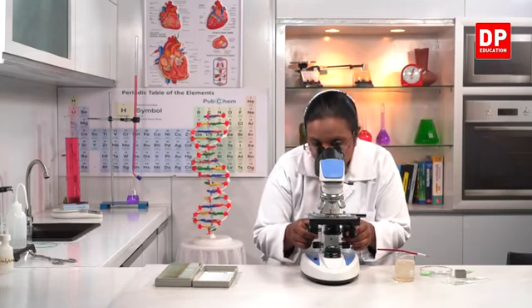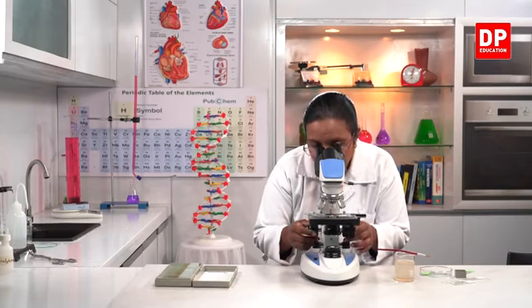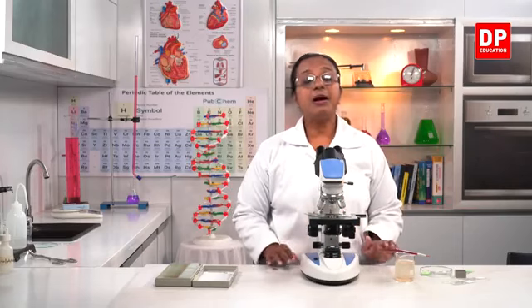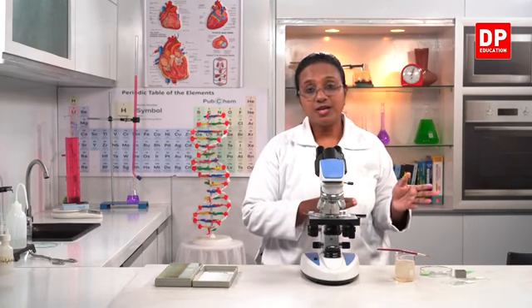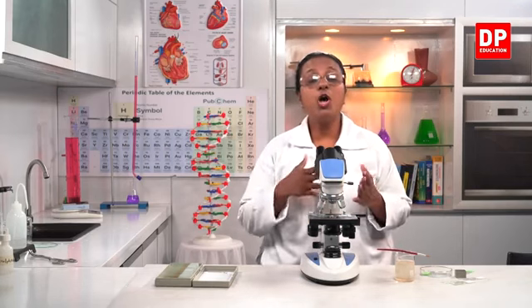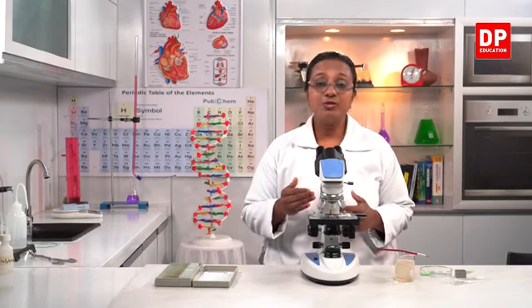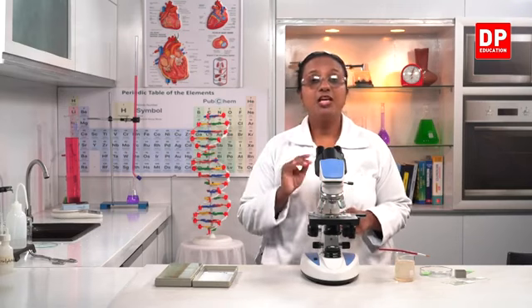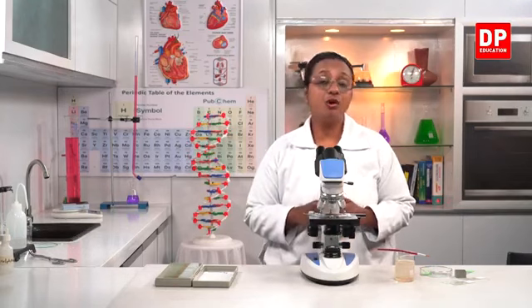So when we observe, now can you all see those cell structures? This is the tissue present in heart. Is it clear to you all, students? So this is part of a multicellular organism. So can you all understand the relationship? There are organisms that are only unicellular. At the same time, there are organisms where you have the organizational levels, and this is the organizational level where you see the cells and the tissues. You can't see the cells individually, but you can observe the tissue of the heart.